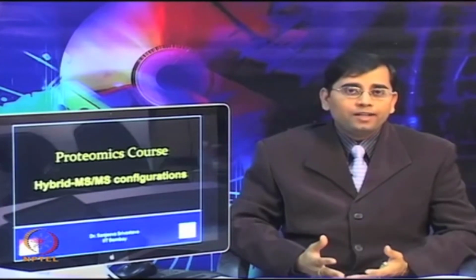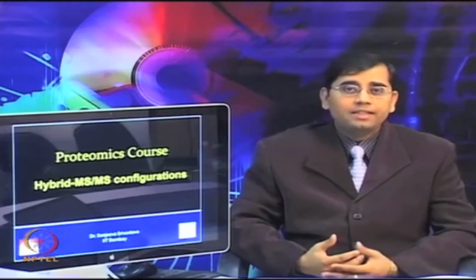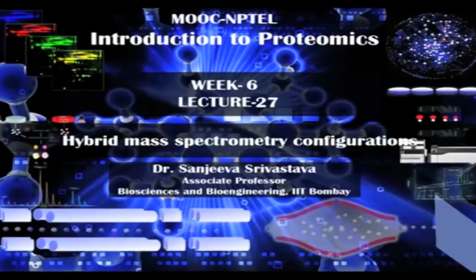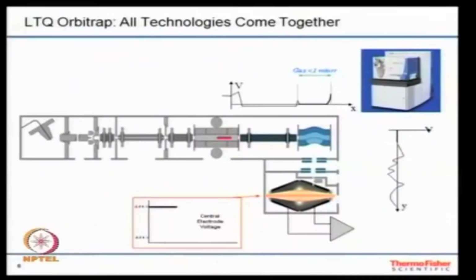We have discussed that different types of hybrid MS or tandem MS can be used for various proteomic applications. There are several new advancements which have happened in this field, and to keep up the pace with these recent advancements, in today's lecture, I thought to involve a discussion on hybrid MS-MS configurations and talk with two leading companies, one with Agilent Technologies for QTOF and triple quadrupole, as well as the chip technology, and then with Thermo Fisher about the Orbitrap technology.